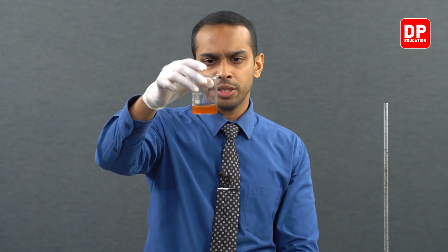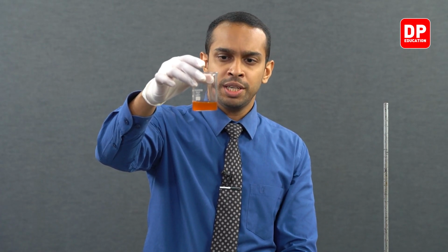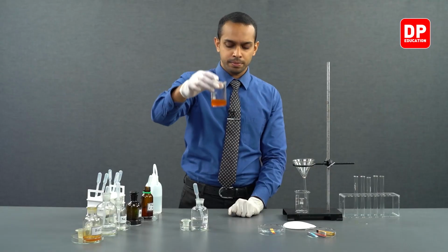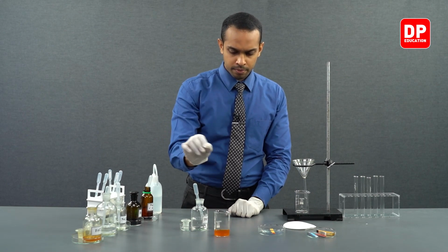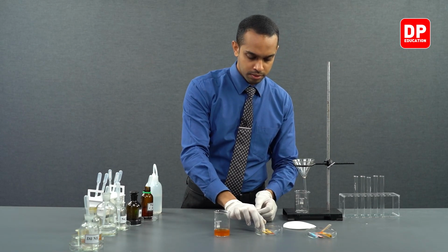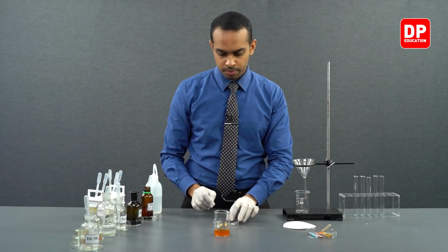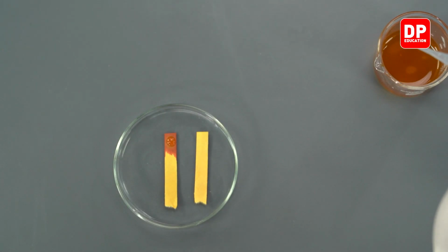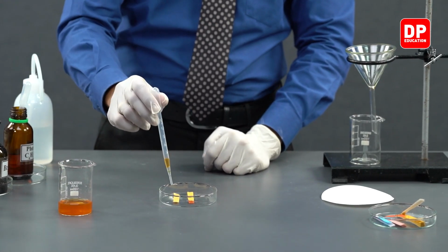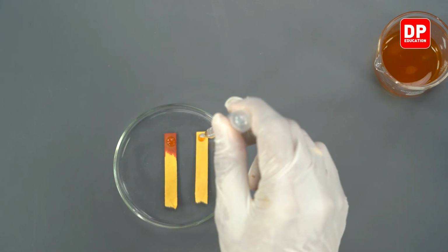Before we move on to filtering the solution, we can double check if we have formed a neutral solution by using a pH paper. We have our pH paper here. Let's add a drop of neutral ferric chloride here to see if the solution has actually become neutral.